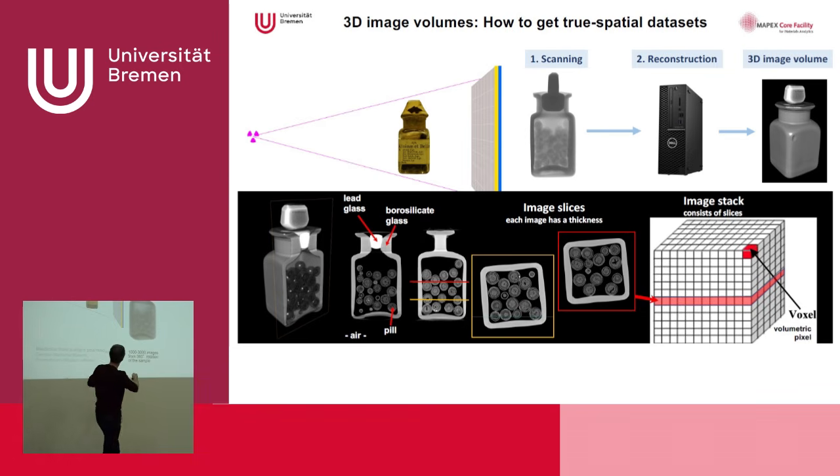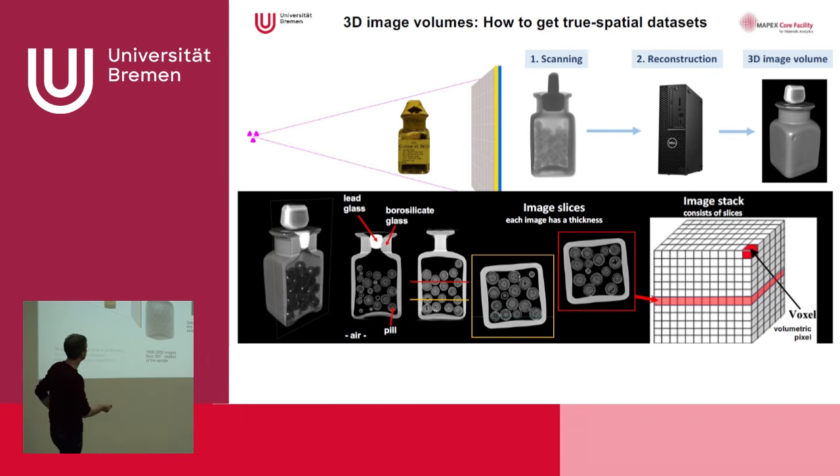This palette here now is smaller than the other, but when we turn it, now you see the other side, this palette now is bigger. So we really have a perspective in these kind of scanning images, and the computer then is trying to reconstruct this model. So the computer thinks, what's happening with the sample, how does it look from all sides, and then presents you a volume data set.